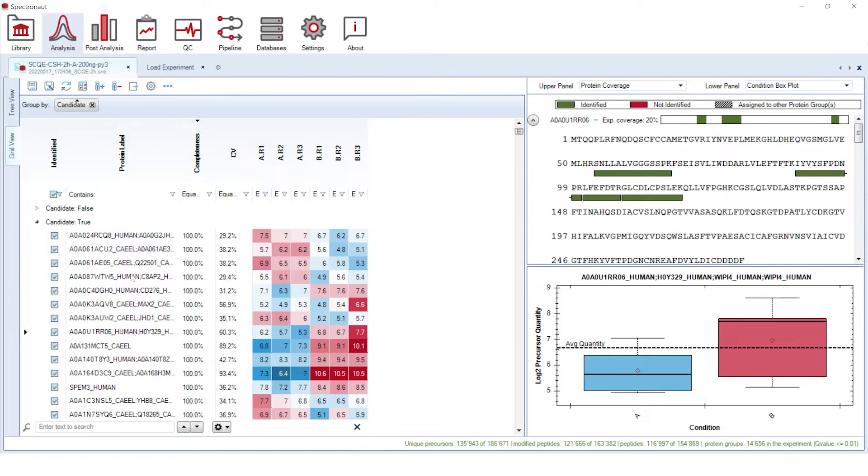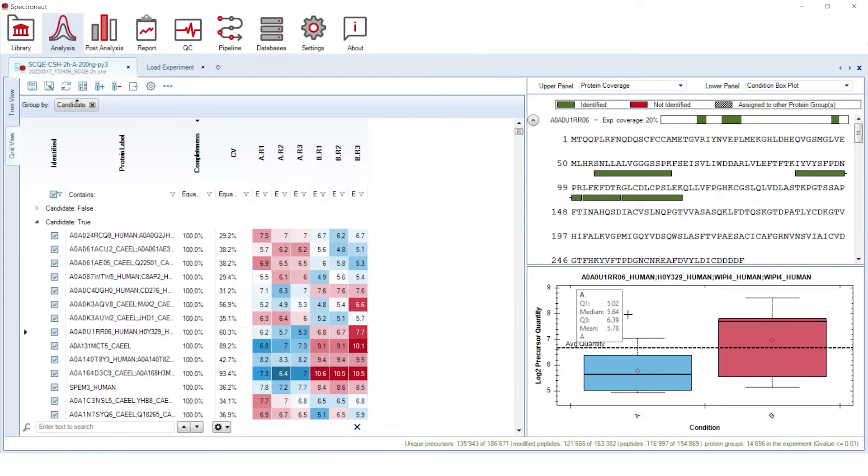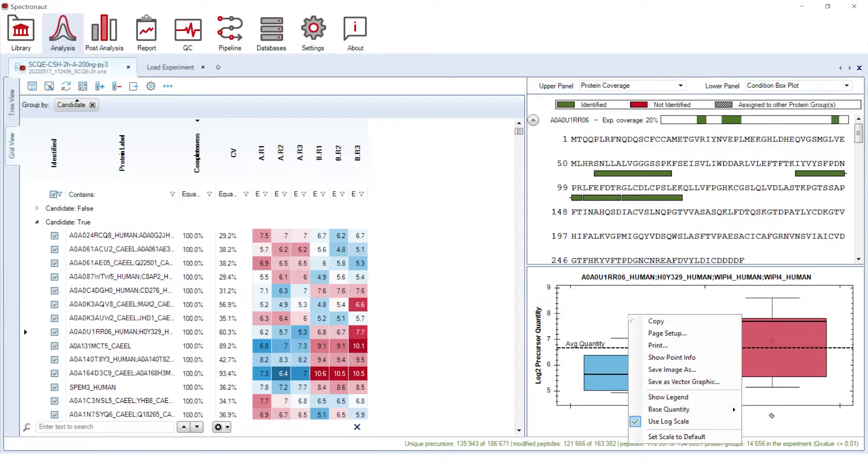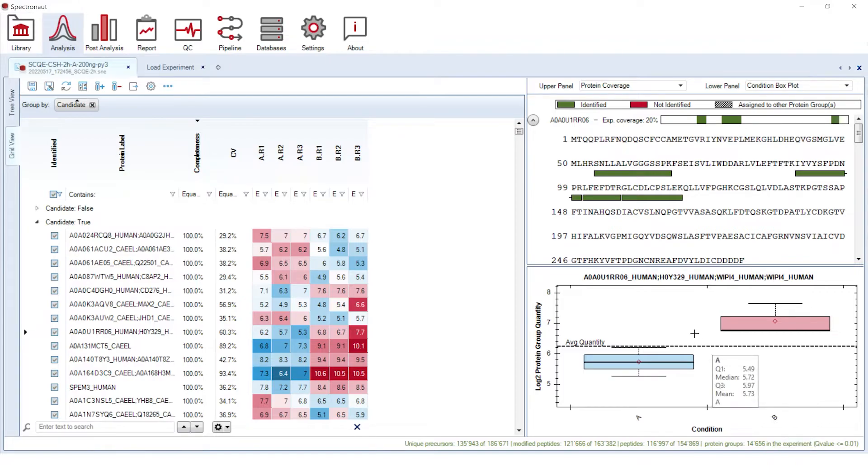On the right side, you can find protein coverage plot and condition box plot representing quantities of the protein precursors within experimental conditions. Like many other plots in Spectronaut, the condition box plot has additional functions accessible after right-clicking on the plot. For example, we can change the base of the display data from precursors to protein groups.